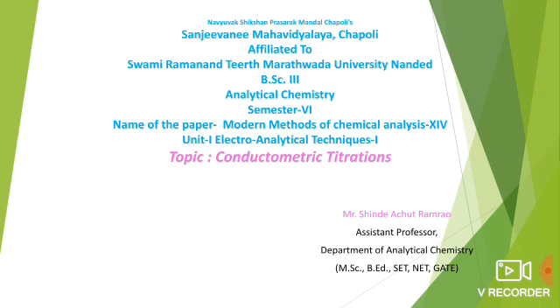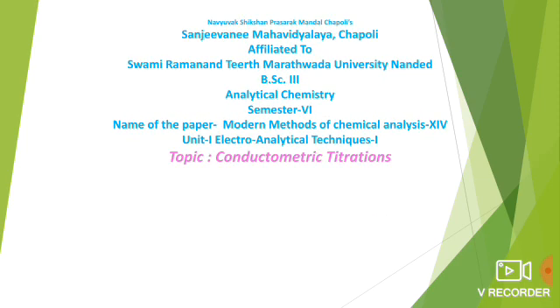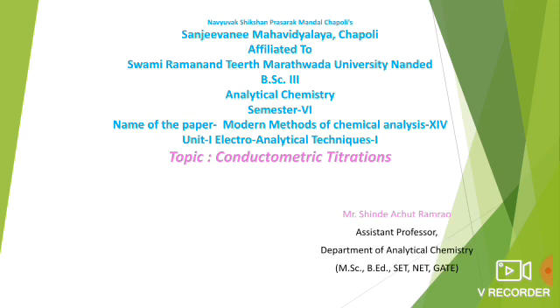In the last lecture, we learned about Unit 1, Electro-Analytical Techniques, and from this, the topic of conductometric measurement. Under this topic, we learned about the measurement of conductance with the help of a conductometer, that is, the conductivity cell, as well as the Wheatstone bridge apparatus.